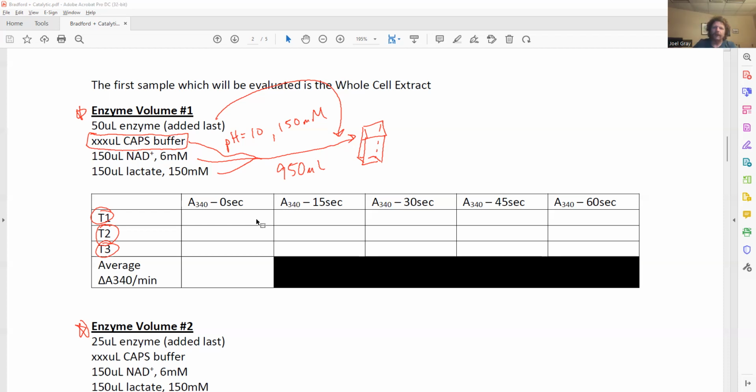You will put the enzyme fraction into the cuvette, press read sample at 0 seconds, then with a watch or a timer of some sort, count to 15 seconds, press read sample, 15 seconds, read the sample, 15 seconds, read the sample. I want your timing to be based on when you get a result from reading that sample, because if you base it on when you press read sample, the spectrophotometer will make some noise as it begins to read. Several seconds later, you will get a display with the absorbance at 340 nanometers. As soon as you see that display, record it and simultaneously press read sample.